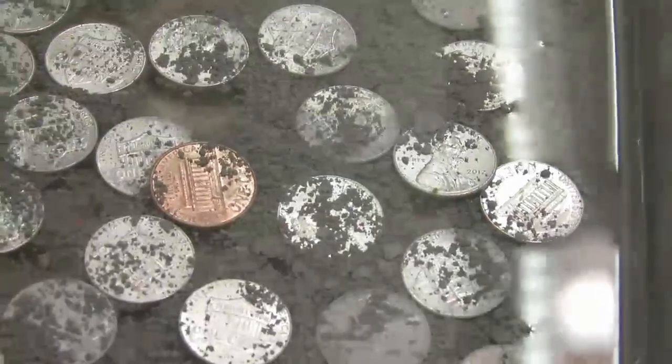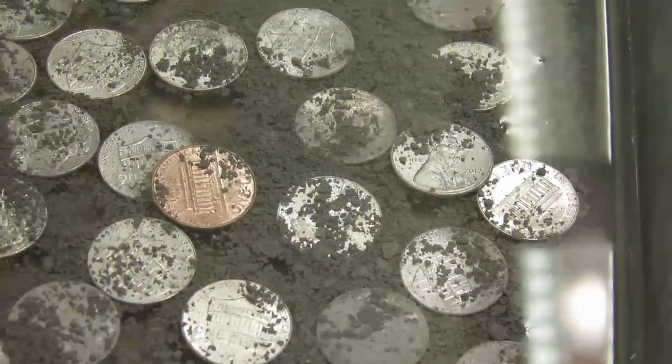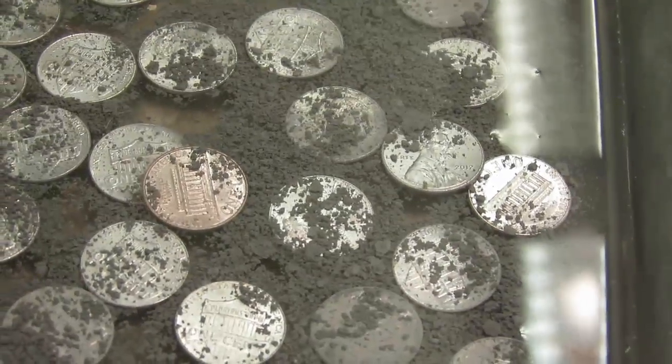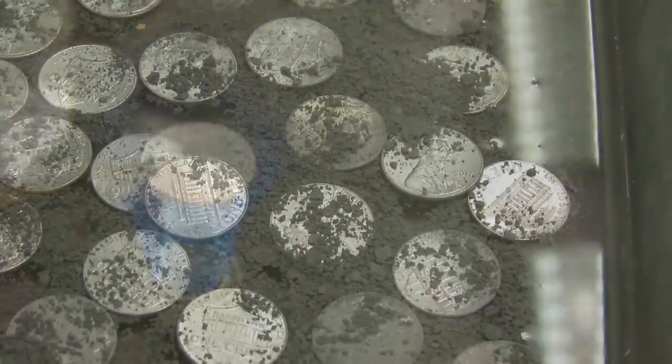You can see close up here — we put the penny in the sodium hydroxide zinc solution, and right away the color starts to lighten. After just a little bit, you can see it's being coated with the zinc on the outside of the penny. And then after a little while, the copper color is no longer visible. We just see that zinc color.